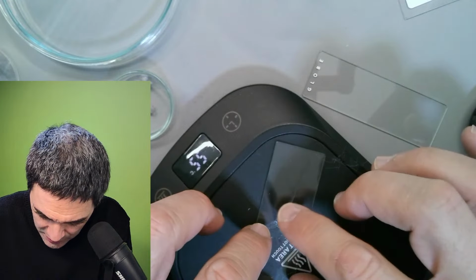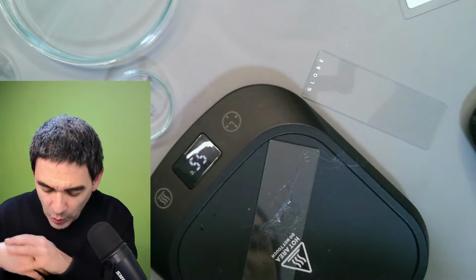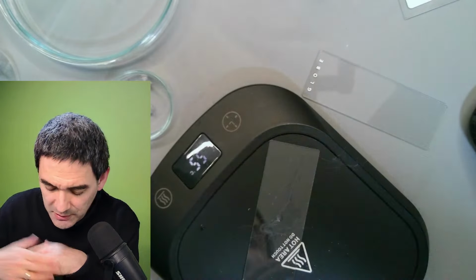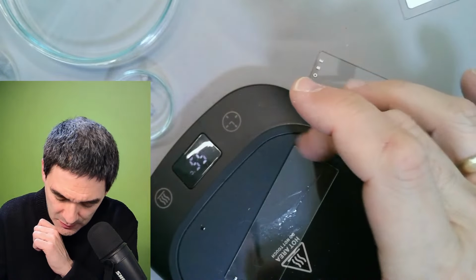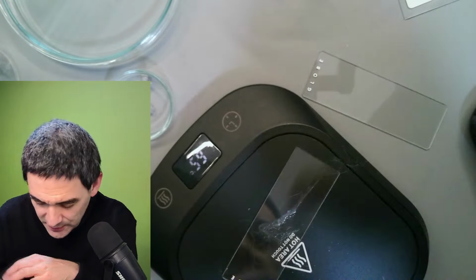And then I'm just drying it right now. So the water is only so that it's flat, because I need it to be accessible with the soldering iron. And you see it's already drying. Maybe we can make it a little bit hotter, 65 degrees Celsius.